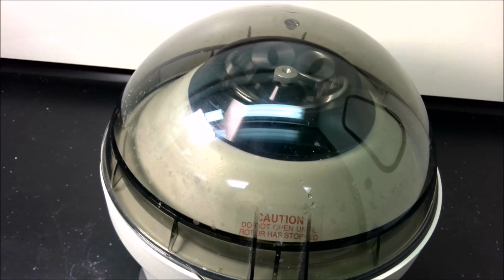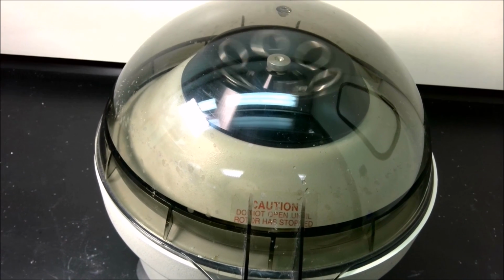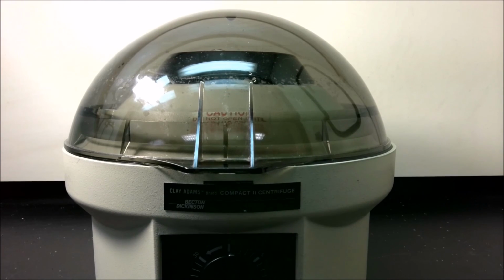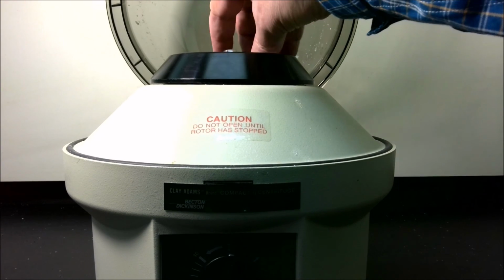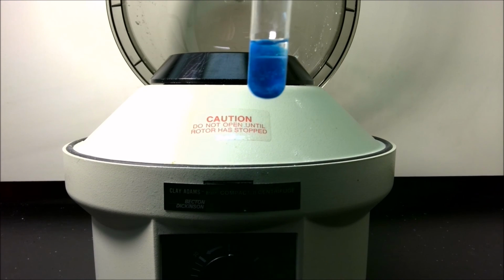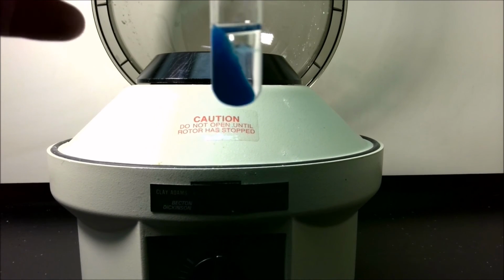Down significantly, but it's still not quite stopped. Give it more time. Once it's slowed down to a safe speed, reach in, grab our sample tube. If you look at it, notice how the solid has now been pulled to one side, and we have a clear liquid floating above. The liquid is called the supernatant.